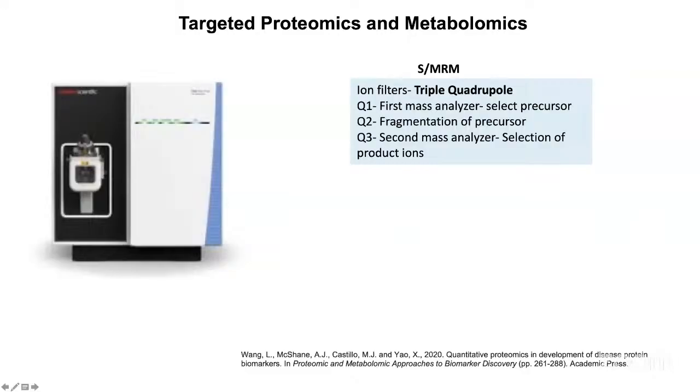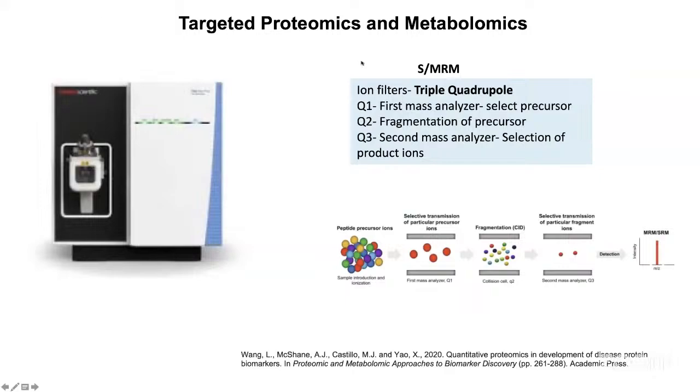So QE, as you have already heard, can do multiple things, and we feel this is one of the very robust instruments for doing multiomics. But of course, once you have identified your good targets, whether it's the peptides or proteins coming from, let's say, Orbitrap technology, or you have identified some metabolites and lipids using another instrument, then you want to validate those.